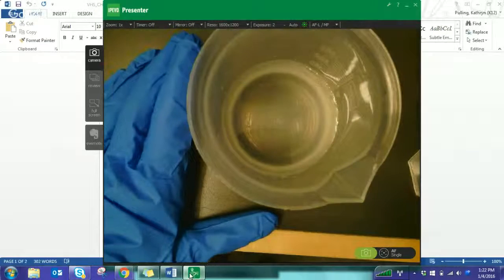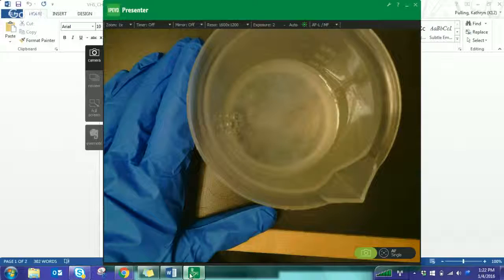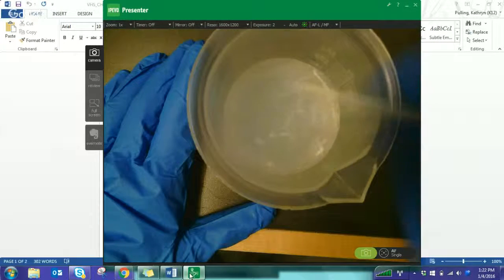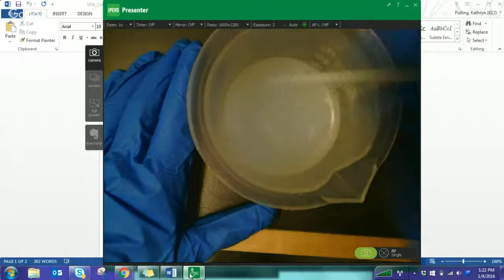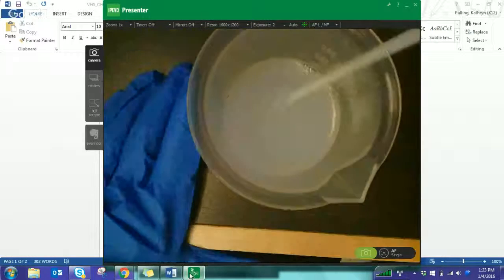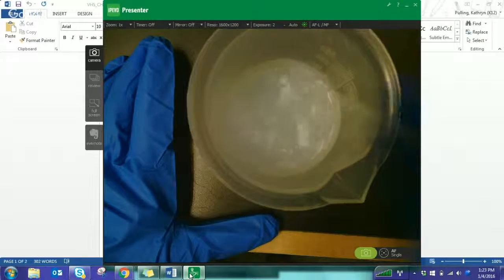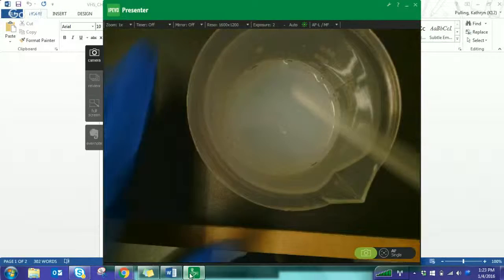So, stir in 10 milliliters of ammonia and record your observations. Here we go. You can already kind of see something happening. A precipitate is forming. You can see some strings. So we got a color change here, and as it was forming, you can tell that it was a solid. We formed a precipitate. You can see that we went from clear to this milky color.